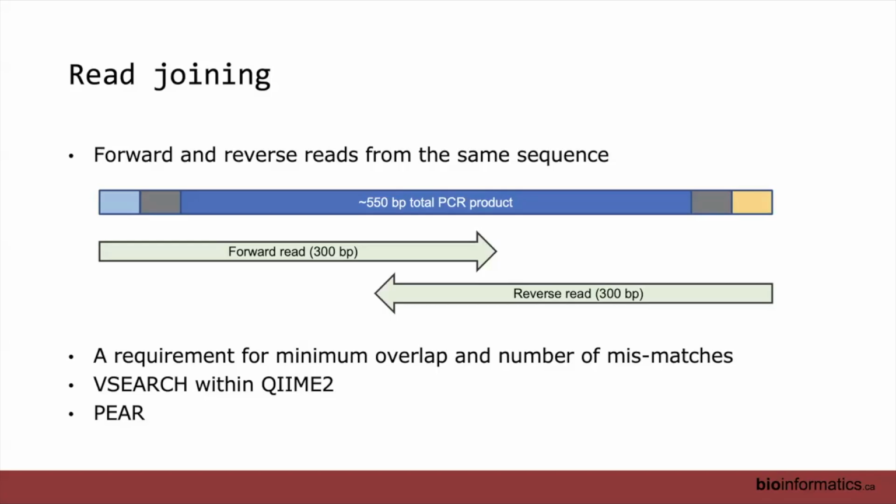When you have complete overlap, does that mean the sequencing reads are getting shorter? Yeah, because essentially, if you only have 300 base pairs in each direction, that limits you. If you're looking for almost 290 base pairs overlap, that's your maximum length. And if you're trying to assign taxonomy to that, then you've only got 290 base pairs of information for doing that with. Whereas if you have a longer one, you're more likely to see variation between different taxa that allows you to assign it to a lower level.